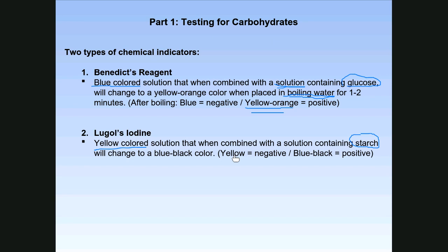If there's no starch in the solution, and the solution's a clear solution, it'll just turn it yellow. Some solutions we test using Lugol's aren't a clear color, so you're not going to see a blue or a yellow, but it doesn't matter. You will see the positive color for sure if it's positive. But in either case, if you add Lugol's to a clear solution and there's no starch, it'll just turn the solution yellow.